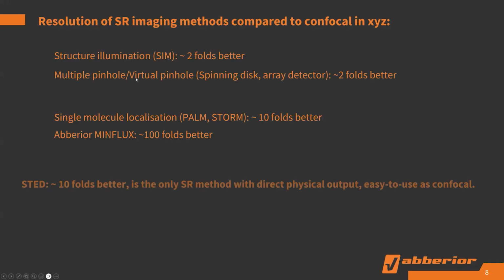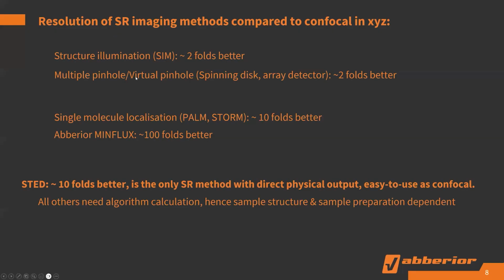So this slide lists all the super resolution methods. We always use confocal as a reference. Confocal is a very general, common instrument now. The first time I used confocal was in 1997. At that moment, confocal was absolutely high-end. Now, confocal is an entry-level technique for biological research.